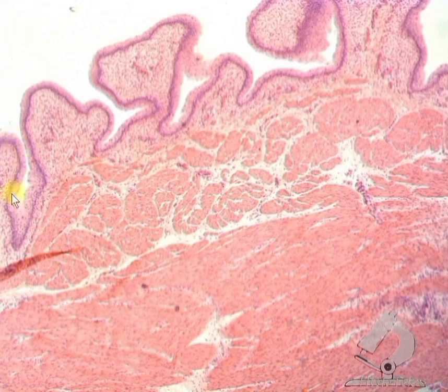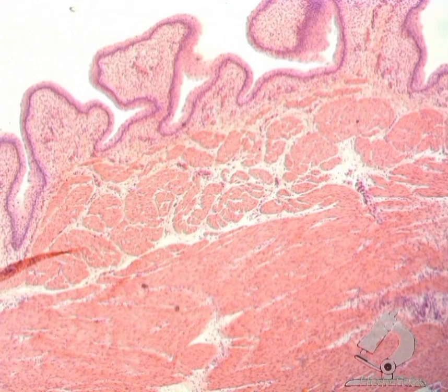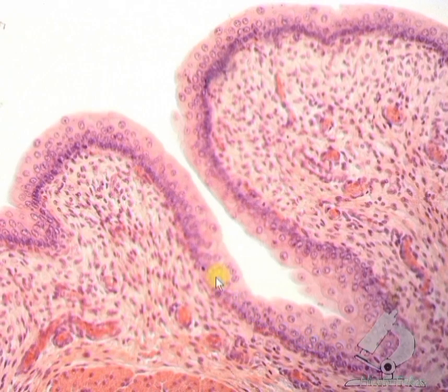Like any surface epithelium, the urothelium lies on the border of the organ and looks like a strip framing the edge of the section. The transitional epithelium is one of the types of the stratified epithelia. It consists of several layers of cells. That is, not all cells are adjacent to the basement membrane, but only cells of the lower basal layer.